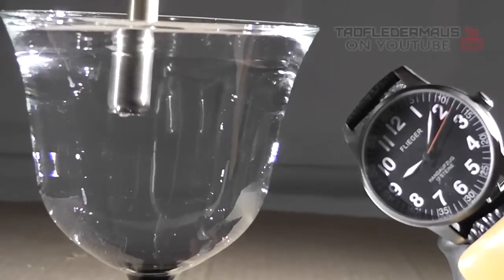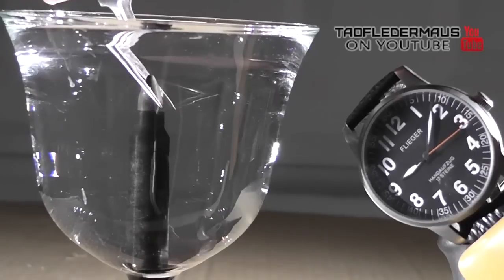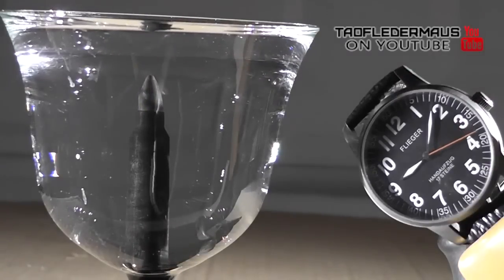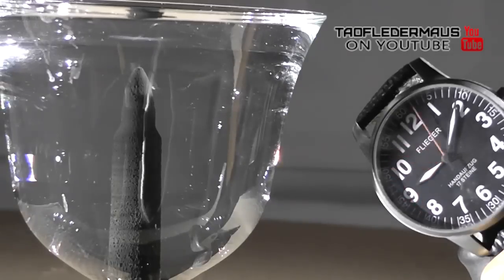Silver nitrate is made by taking pure silver and dissolving it in nitric acid. This is a solution of silver nitrate in distilled water. The solution gradually acquires a bluish color characteristic of hydrated copper, which is in the brass.